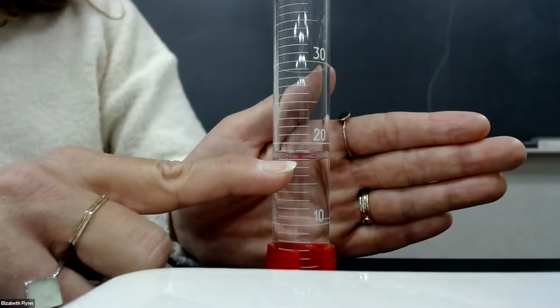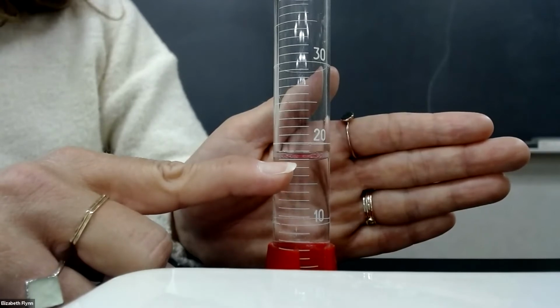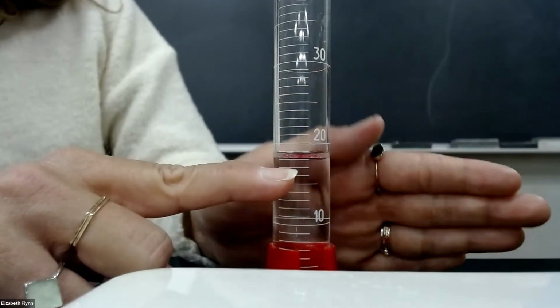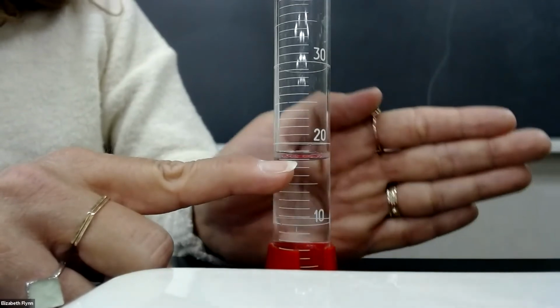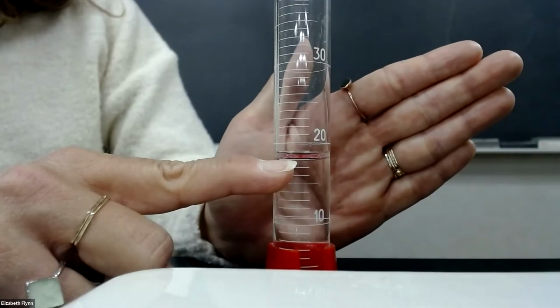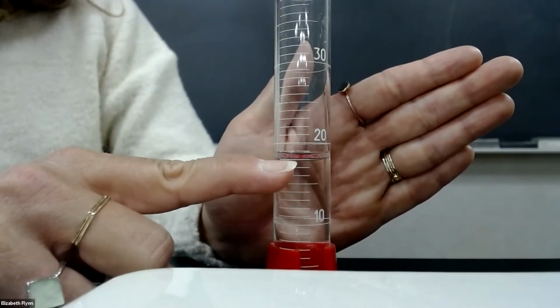Right? It's just below this line right here. So we know it's 15, 16, 17. What do we think? 17. What do we think? Sure, 17.9 sounds good to me, right? Because we're estimating between these two lines.